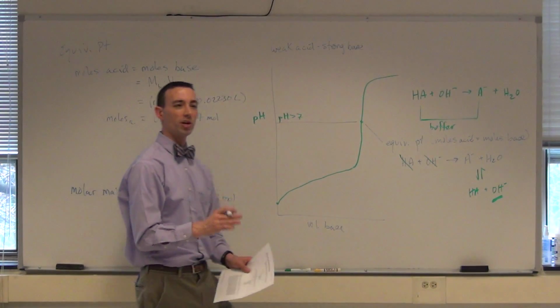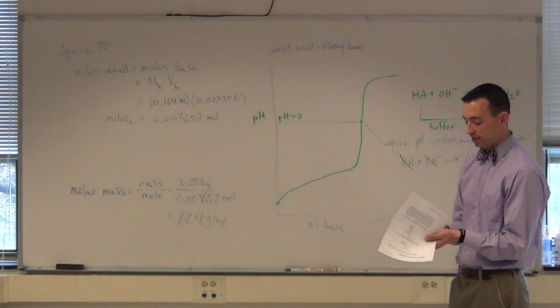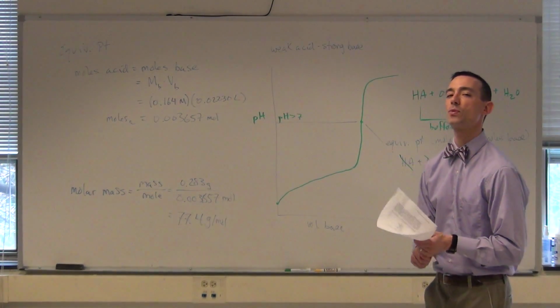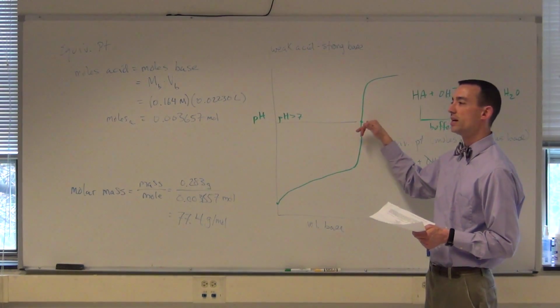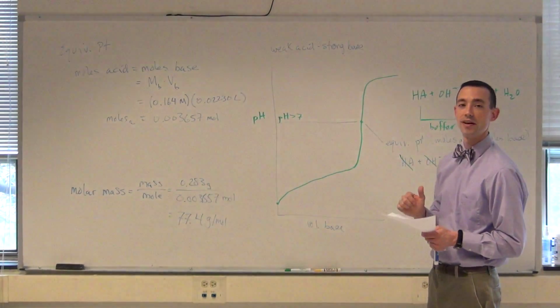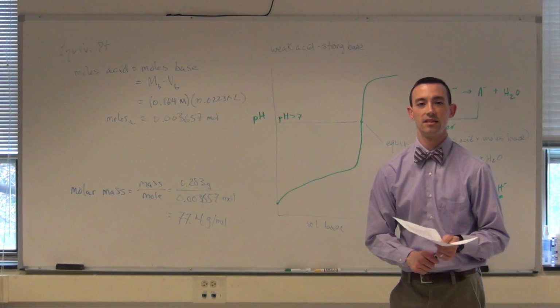This should also look pretty familiar since it was part of the acid-base titration experiment in Chemistry 1. Okay, so a lot is the same as what we did in Chem 1. The difference is that we're visualizing the endpoint through a different technique in today's experiment. All right? So you'll get your molar mass of your unknown acid.